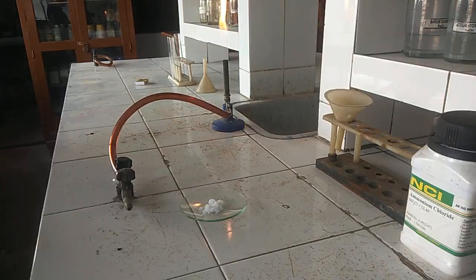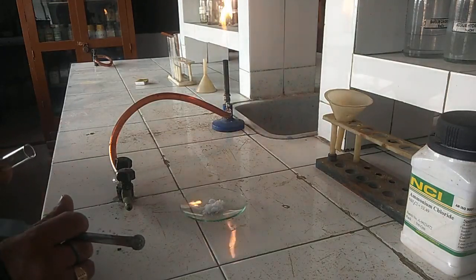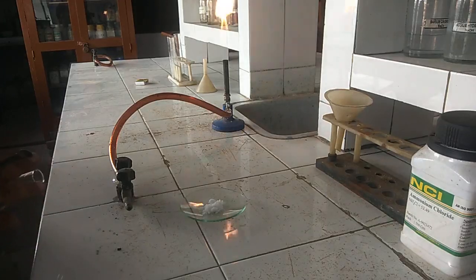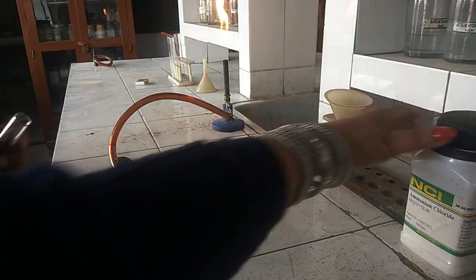Now we will check the presence of chloride ions in the given salt. The common salt which contains chloride ions in it is sodium chloride, which is generally used in our homes. Another important salt of chloride ion is calcium chloride. Today we will test chloride ion in ammonium chloride.